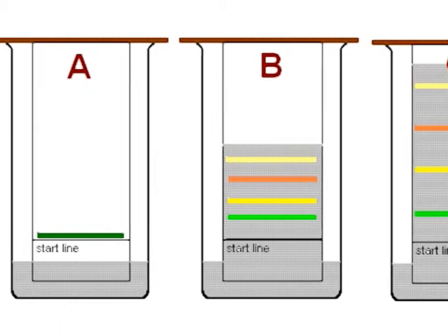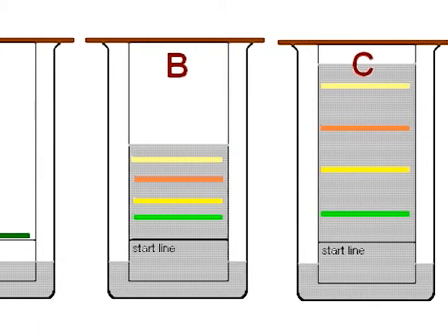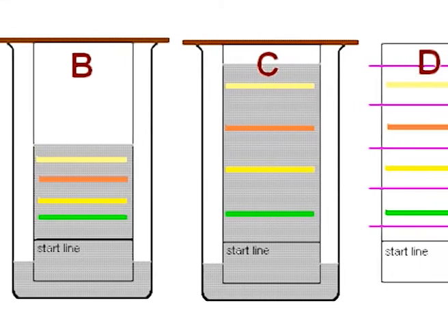Applications of paper chromatography. Paper chromatography has been used for separation of mixtures having polar and non-polar compounds such as amino acids, hormones, drugs and other biochemicals. It has been used for the evaluation of inorganic compounds. Although paper chromatography has become very popular due to its simplicity, it suffers from various limitations such as long development time, poor separation, low accuracy in quantitative determinations and low reproducibility.